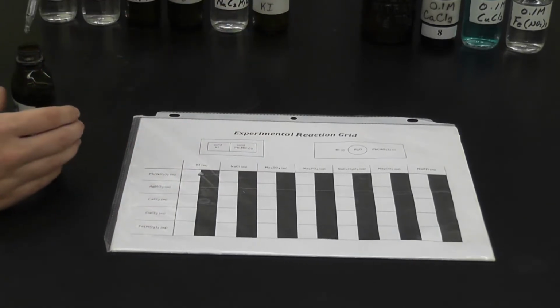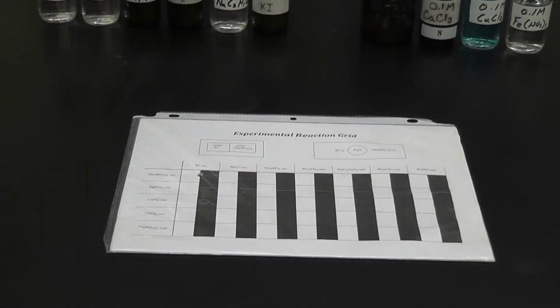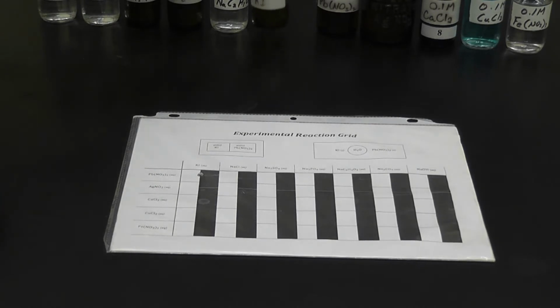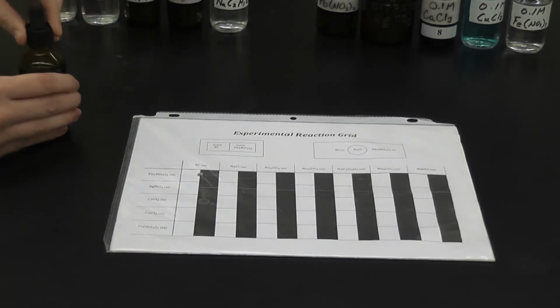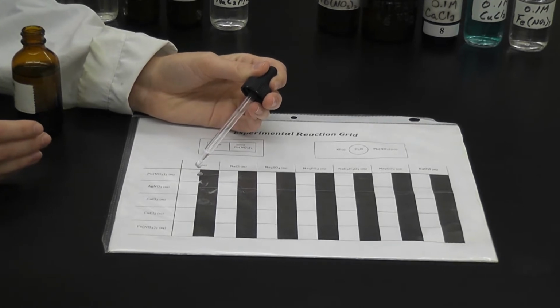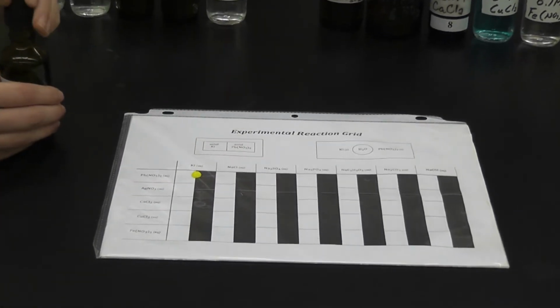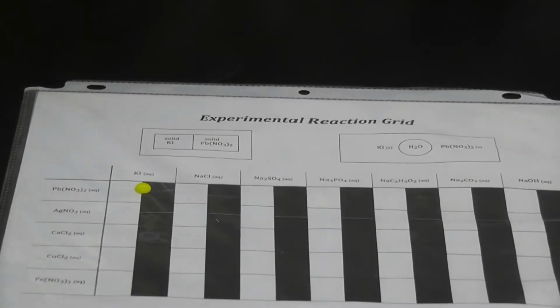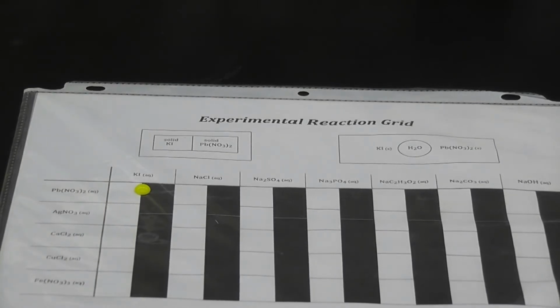Okay. And we do this because we want to observe color change and if there's a precipitate formed. So the black can show the precipitate and the white background can show the color change. So then we're going to add 1 drop of the other solution involved, which is potassium iodide. Okay, so 1 drop. And then we want to observe. All right. So you can see and write in your lab report if you observe a color change, precipitate, and just your overall observations of the reaction of these two.